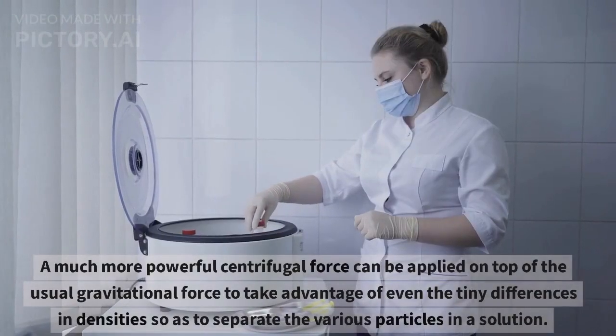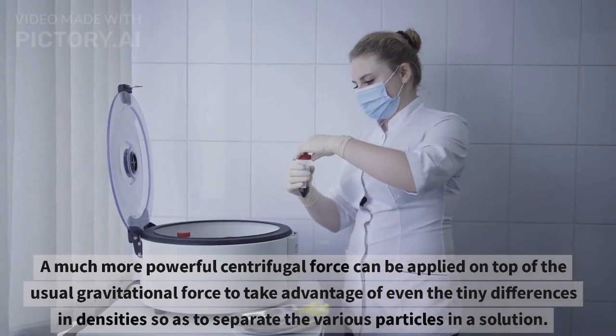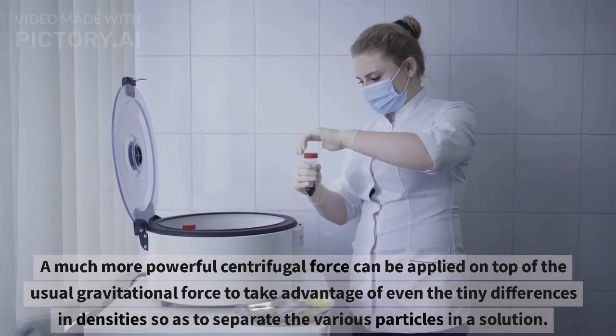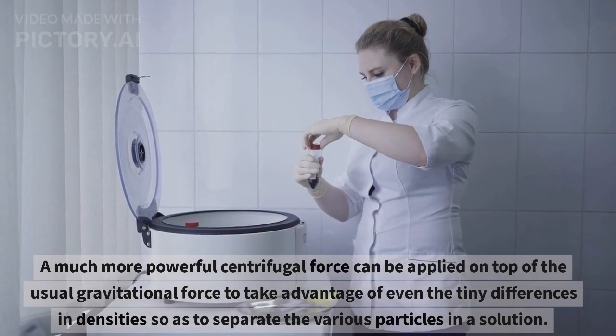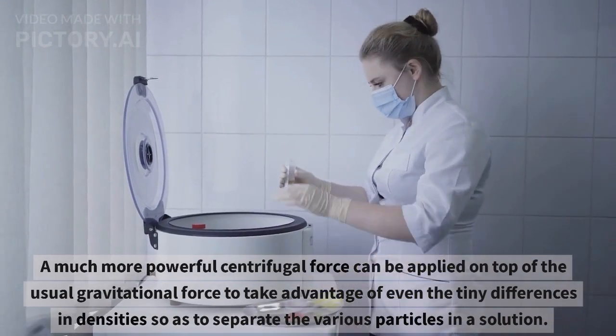A much more powerful centrifugal force can be applied on top of the usual gravitational force to take advantage of even the tiny differences in densities so as to separate the various particles in a solution.